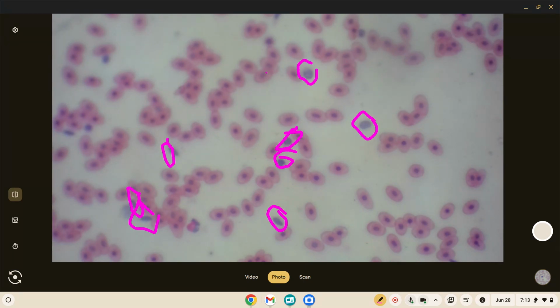Well, there are lots more immune cells than in the human blood. We only got like one in just one area. So there are a lot of immune cells in the frog's blood.